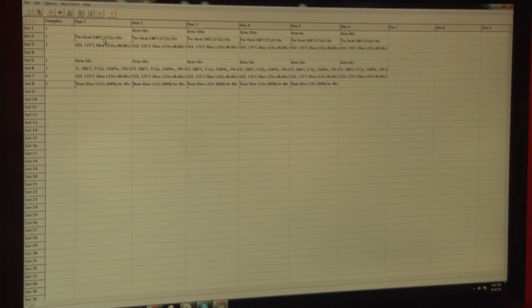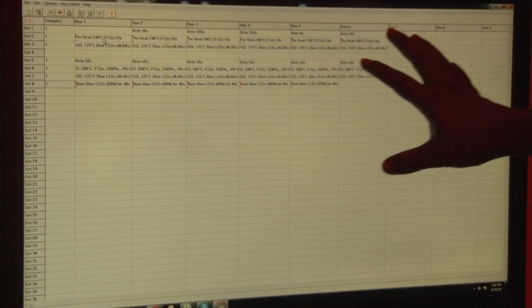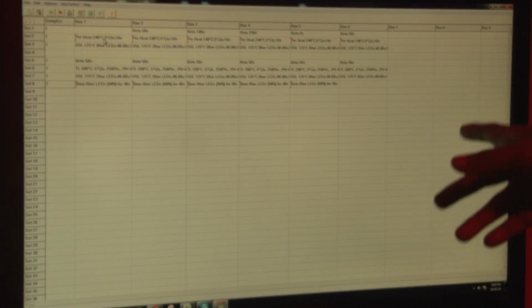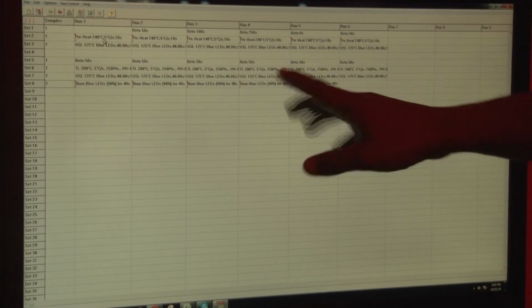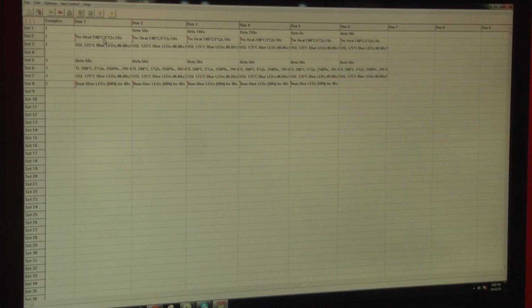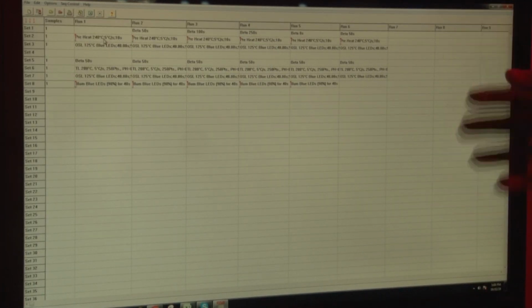Now, this entire sequence which you are seeing on your screen is called the SAR protocol. This SAR protocol was designed by Wintle and Murray in 2000, and it was updated in 2005 and 2006 again. So SAR protocol is basically a procedure to estimate the natural radiation and regenerate that radiation in the laboratory.